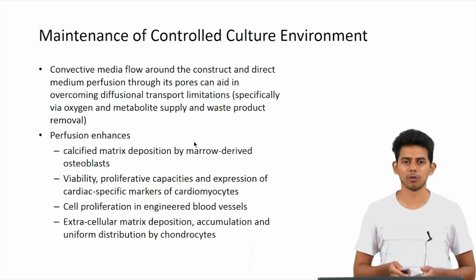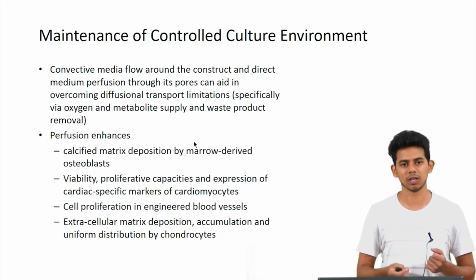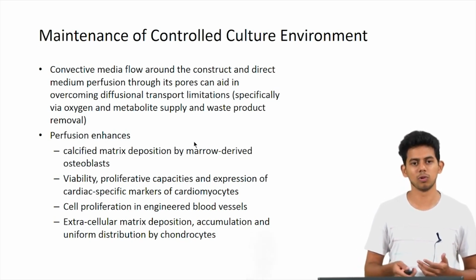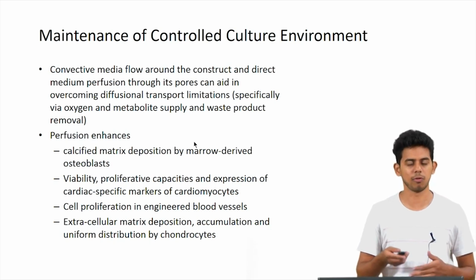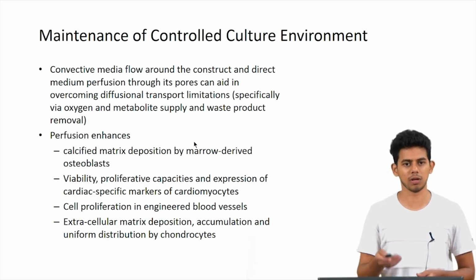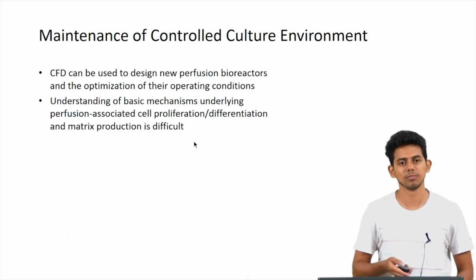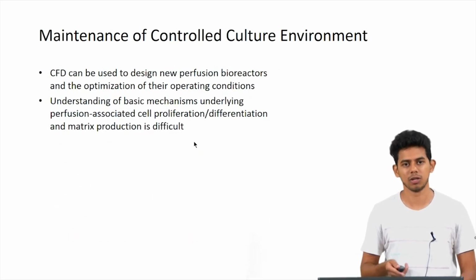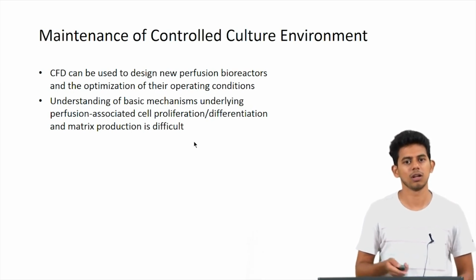So, maintenance of a controlled culture environment. A convective media flow around the construct and also perfusion of this media through the pores can aid in overcoming the diffusional transport limitations. So perfusion can enhance the formation and deposition of ECM as shown in these examples, and also improve the cell proliferation in blood vessels, etc. Computational fluid dynamics can be used to design new perfusion bioreactors and also to optimize their operating conditions.